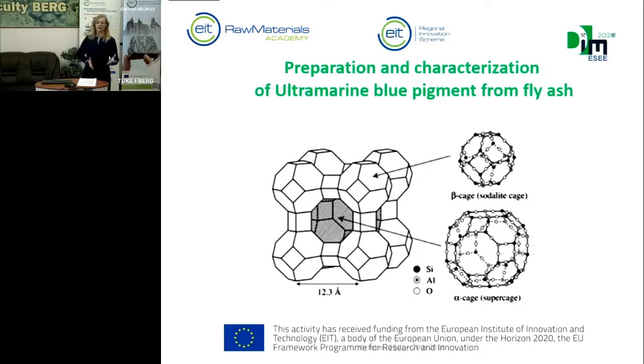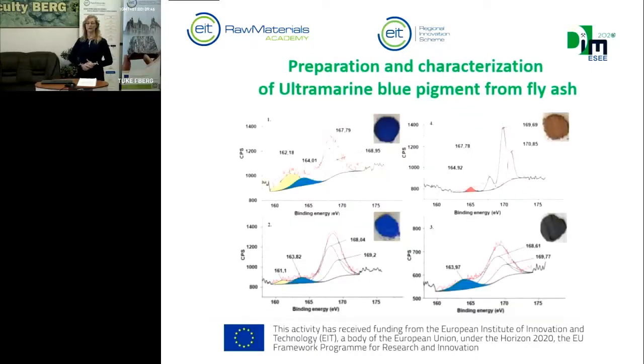This is the base structure of the ultramarine blue pigment. Into the sodalite cage, the chromophores are encapsulated, and by the XPS method, in this picture you can see the results of the measurements.